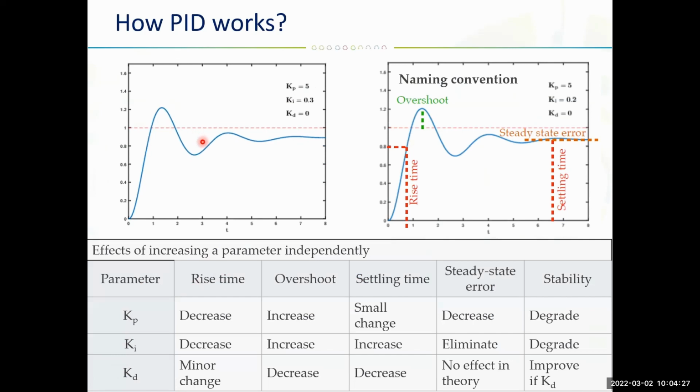Here, these adjustments in mathematical terms are called the Ziegler-Nichols tuning method. It's a heuristic method for tuning the controller. It attempts to produce good values for all three PID gain parameters. Kp here is the controller path gain, Ki is the integrator time constant, and Kd is the derivative time constant. What we are doing here is we try to change each parameter one by one, and try to get as low oscillations as possible as a final result.